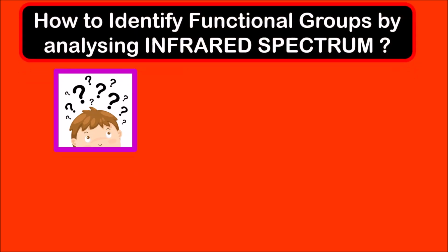So in today's video, we are going to see what is the actual application of the infrared spectrum, that is to identify the functional groups. What we are going to do is interpret the different infrared spectrums that are respective for different functional groups, and we will try to understand the key or important peaks that are specific for a particular functional group.